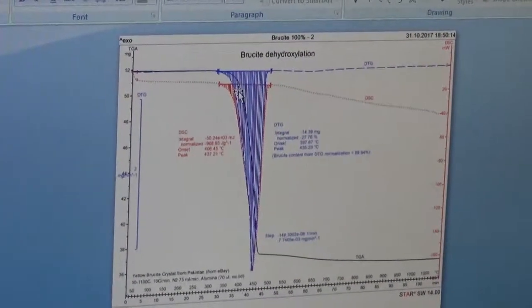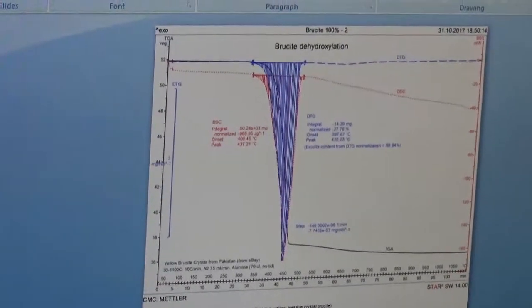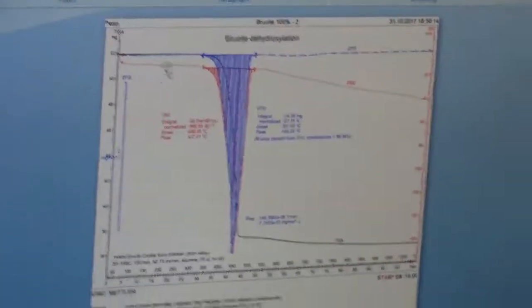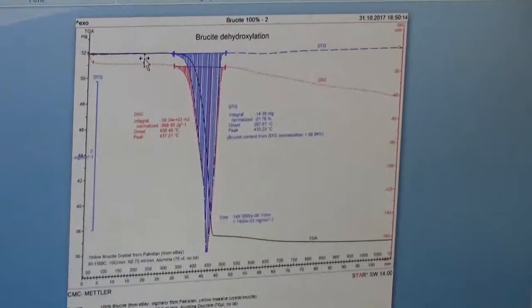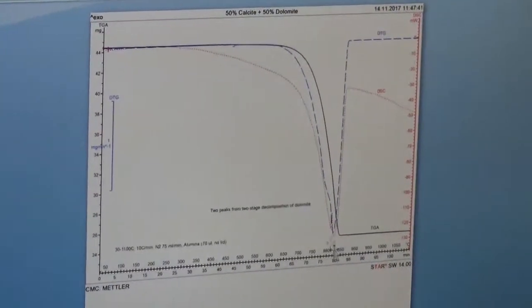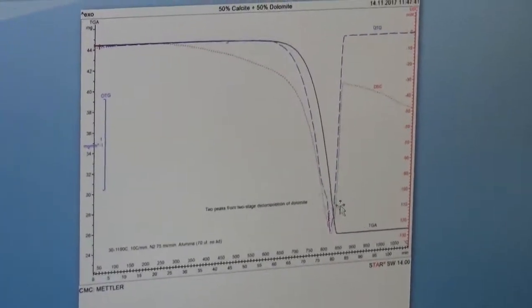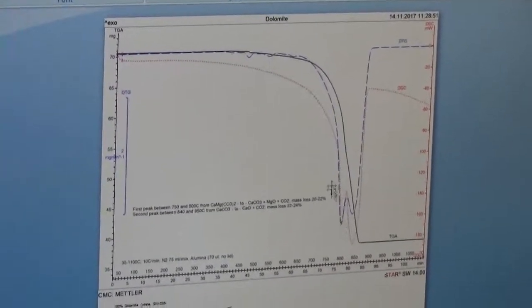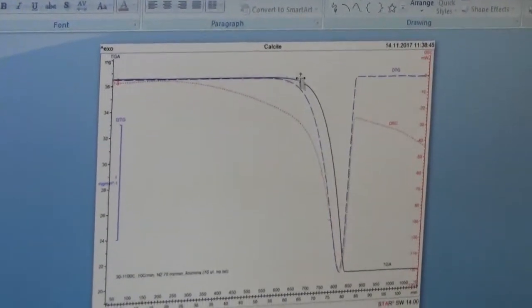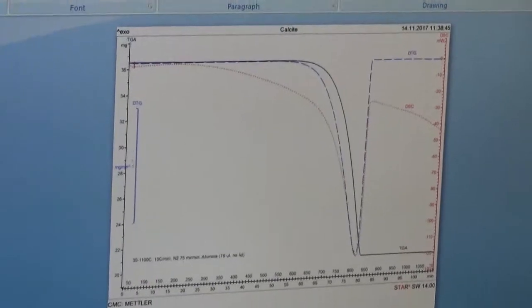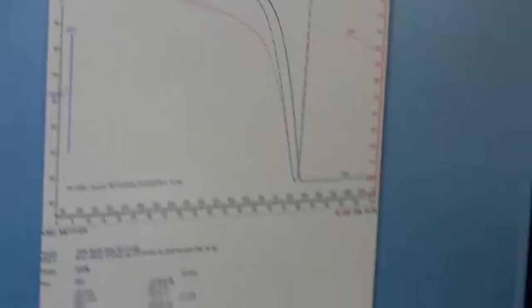This one is the brucite run I was telling about. When we did pure brucite, we got a normalized value of around 980 — that's what we use to determine the brucite content in the unknown sample. It shows DTG in blue dashed, DSC in red dotted, and the black one is the TGA curve. This is 50% calcite and 50% dolomite — it shows the decarbonation temperature and gives a bump when you have a calcite-dolomite mixture. This is pure dolomite — it gives two bumps. This is pure calcite, 100% calcite — all you get is the decarbonation, with recovery around 98.8%.